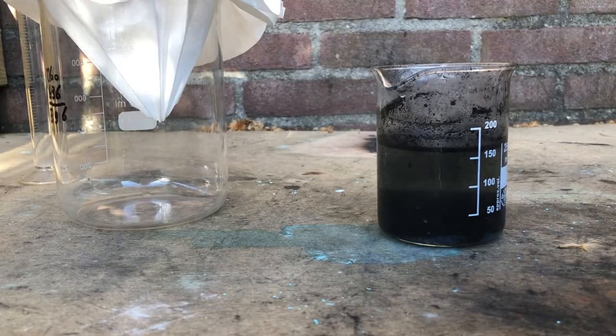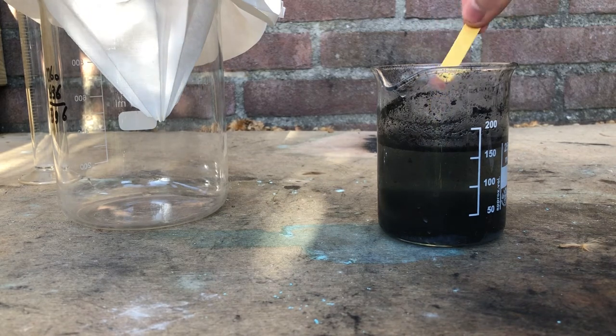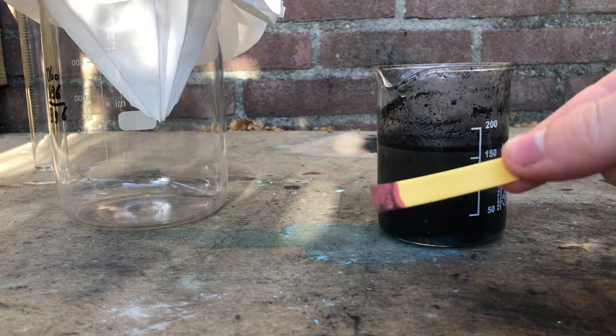Before I filter the solution, I just wanted to test the pH to see if we actually obtained some sulfuric acid. And as you can see, that is the case — we did actually create sulfuric acid, so that's a very good sign.